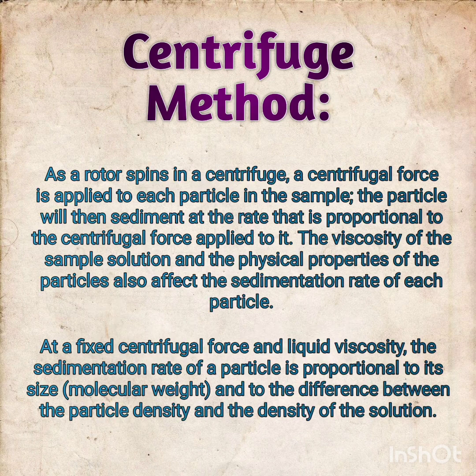Centrifuge method. As a rotor spins in a centrifuge, a centrifugal force is applied to each particle in the sample. We have studied this in the first slide. The particle will then sediment at a rate that is proportional to the centrifugal force applied to it. The viscosity of the sample solution and the physical properties of the particles also affect the sedimentation rate of each particle.